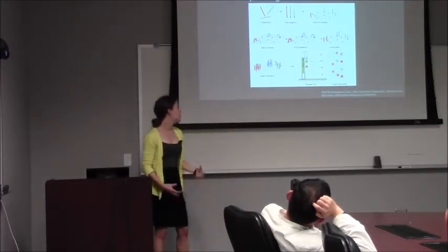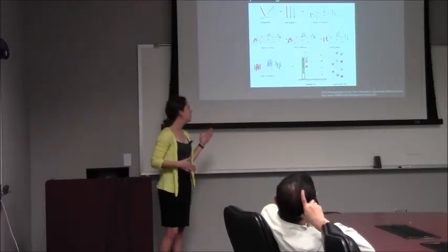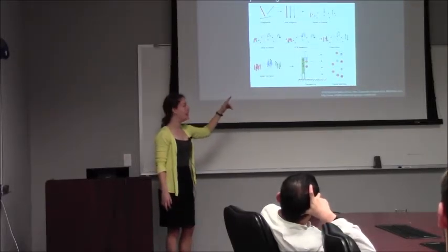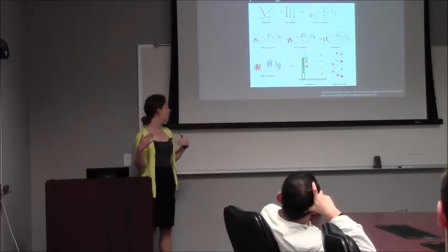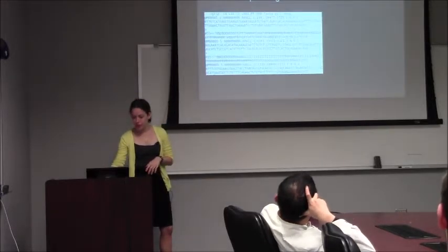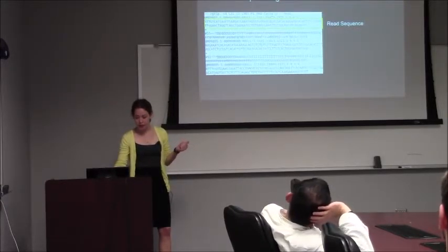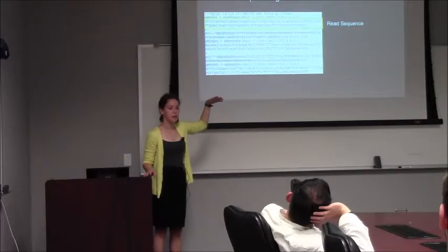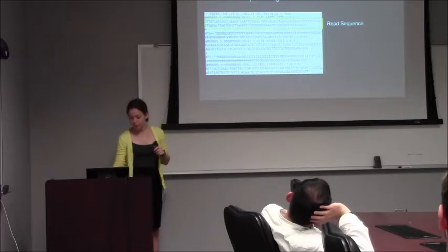So when you're looking at the output, you're going to have a sequence not of the whole thing, but of a bunch of fragments. And there is this uncertainty of, I'm pretty sure I saw blue light, but it's not 100% sure that it's blue light. And so there's a degree to what base pair it thinks is in that sequence. So if you look at this again, first you have the Gs, Cs, As, and Ts, and this is the sequence of the base pairs of the fragment, of one of them. It's called a read, just one piece.